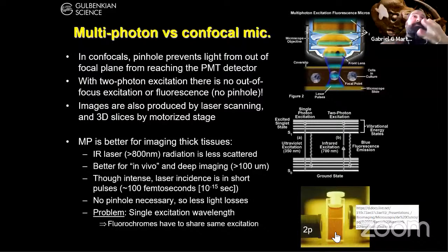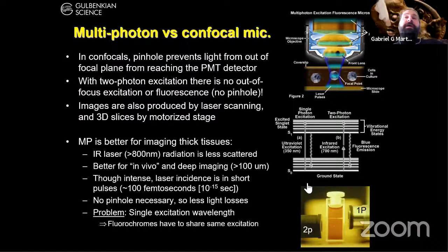But it also has some disadvantages. The slight disadvantage, besides the fact that it's more expensive, as I said, is that the resolution tends to be a little bit lower. And if you remember the formula of resolution that was explained on Tuesday, you know that there's a very intimate relationship between the wavelength that you're using and the resolution. The longer the wavelength, the more towards the red side of the spectrum that you're using the light to image your sample, the lower the resolution.